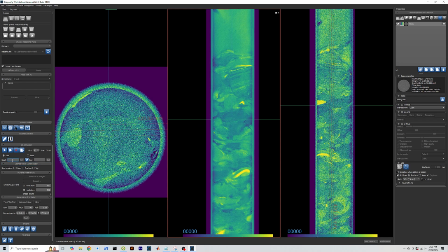And we can set the starting slice and the ending slice. So from here, let's start here. This is slice 0, and as you move up, you get about 950 slices in these CT scans. And so what I'll do is I'll just say, let's go from slice number 300, which should be about here, and we'll end at slice 600, which will be right about here. And so if you didn't want to look at all of this air, that's what you would do.